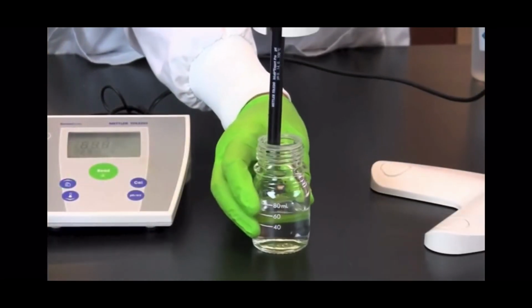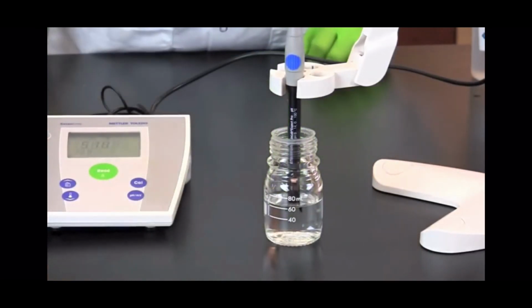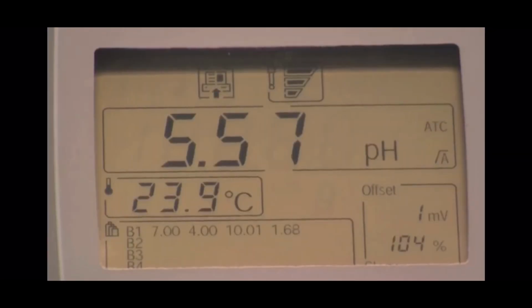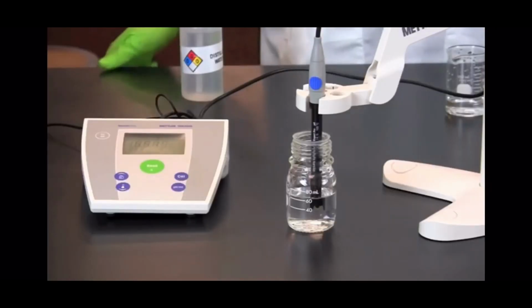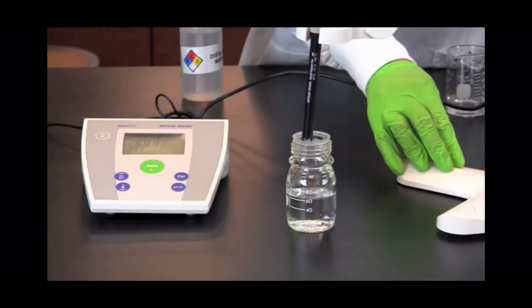Place the unknown solution beneath the electrode and slowly lower the arm so that the electrode is fully submerged in the solution. This sample has a pH of 5.57 at a temperature of 23.9 degrees Celsius. Once the reading is complete, remove your sample.